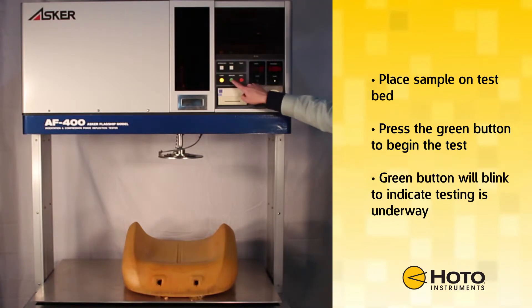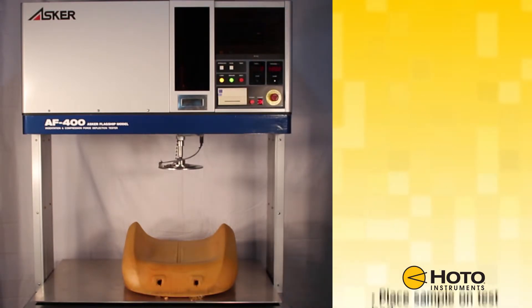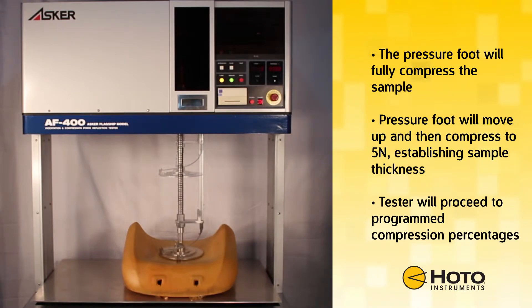Place the sample on the test bed. Press the green button to begin the test. The green button will blink to indicate testing is underway.